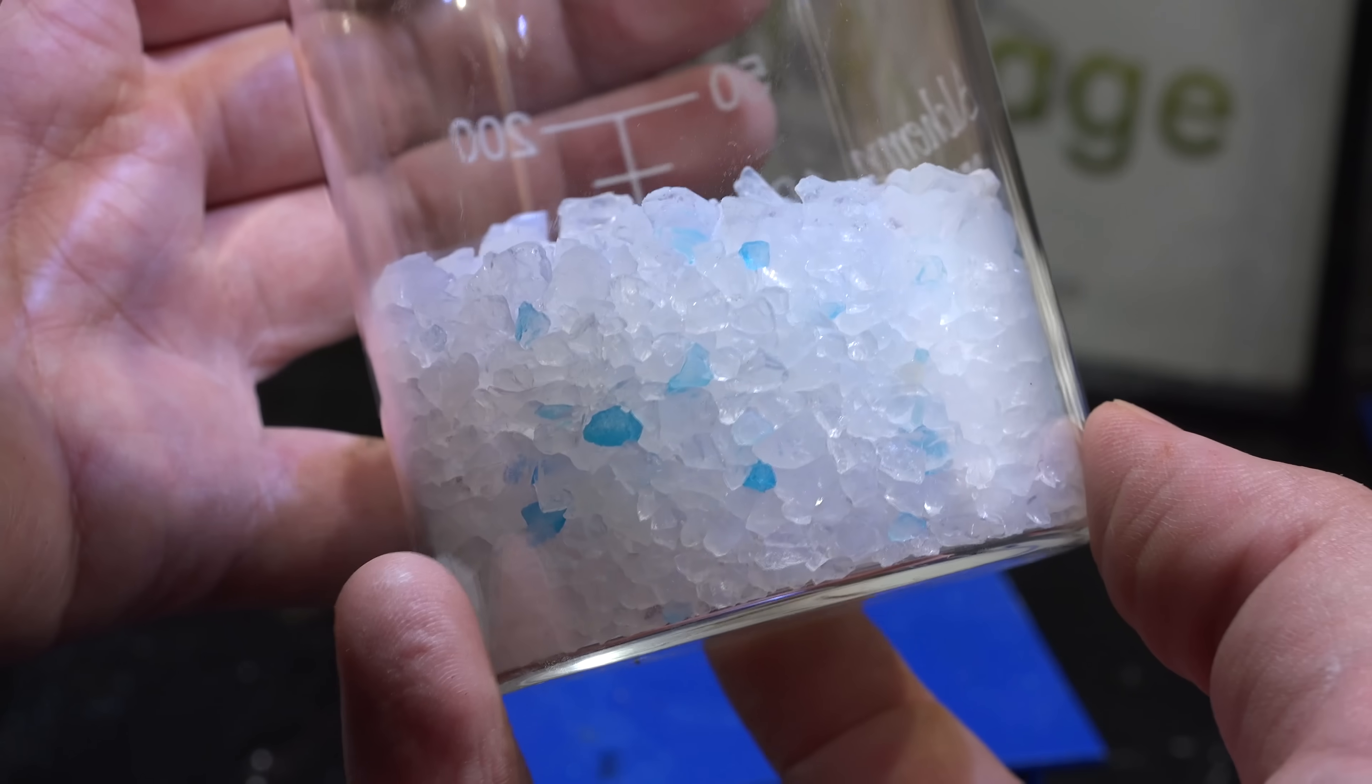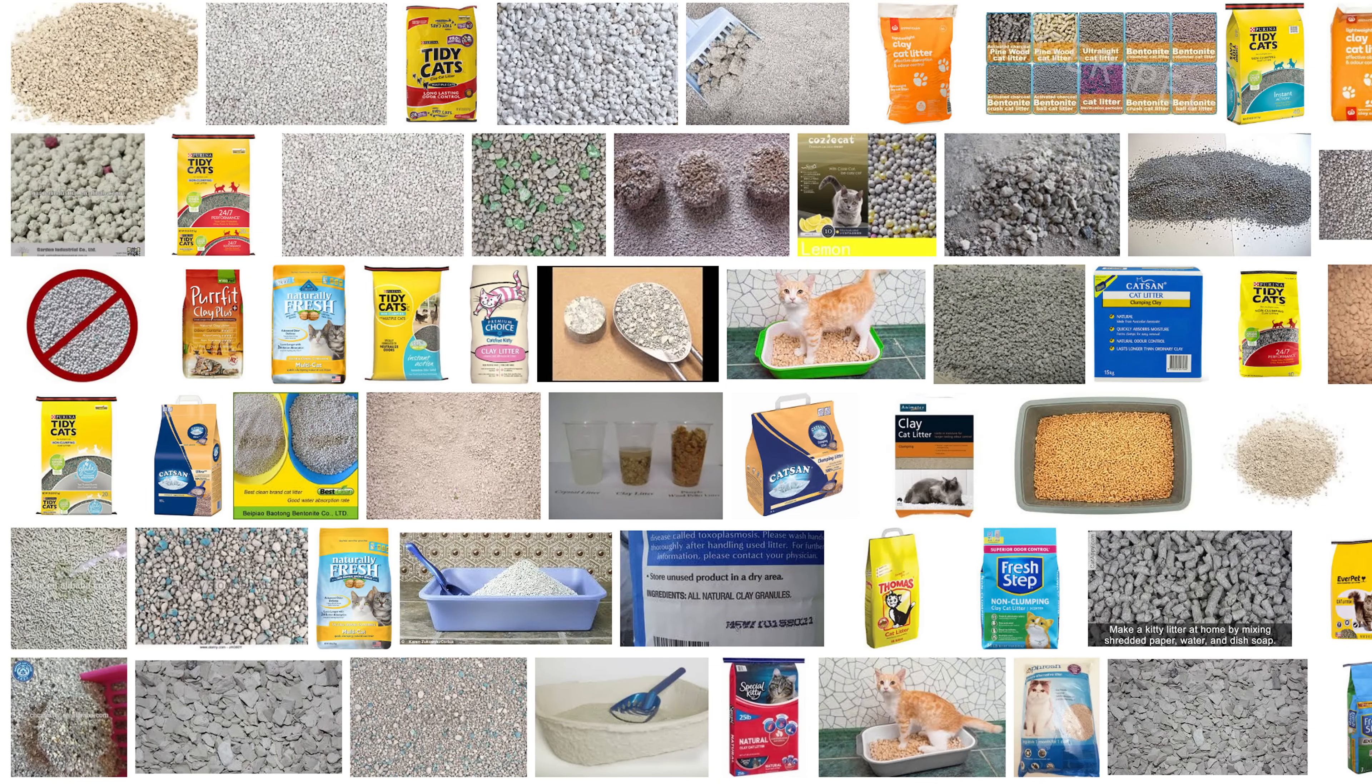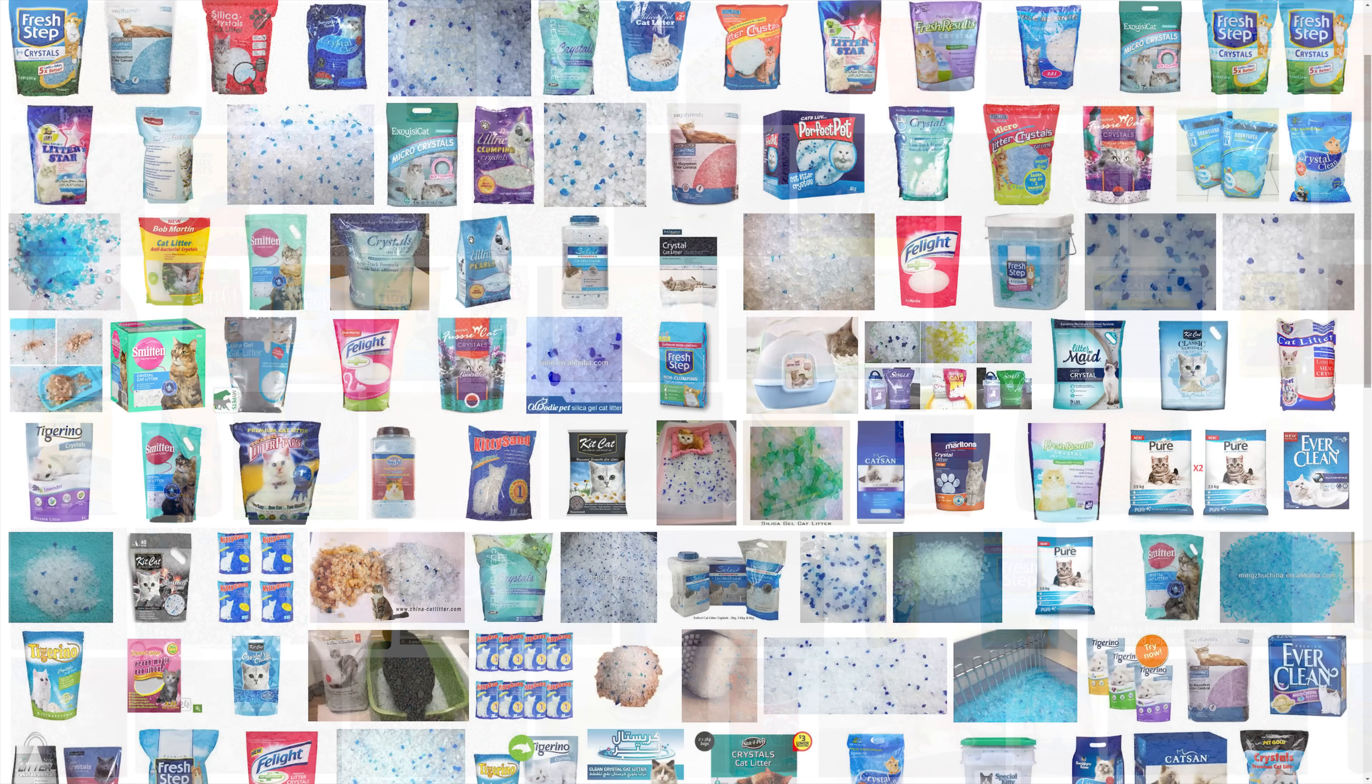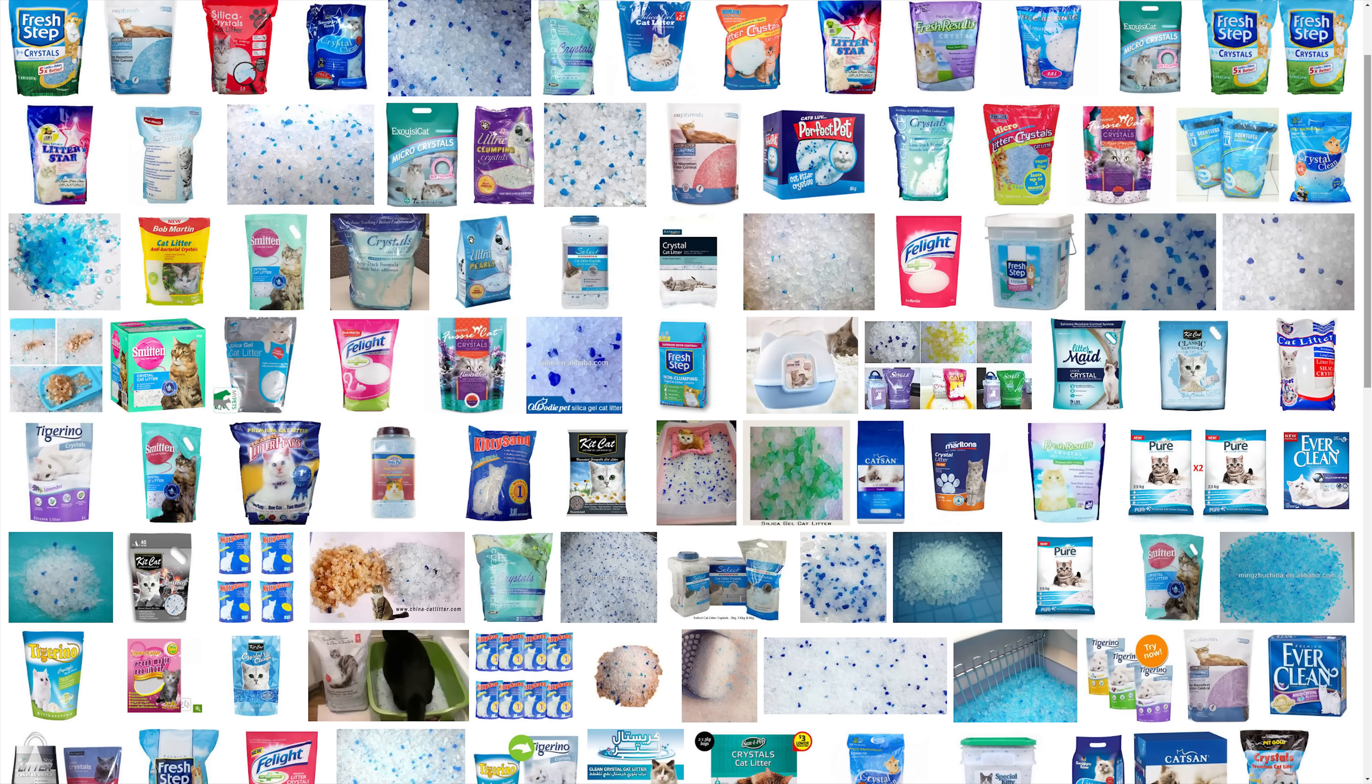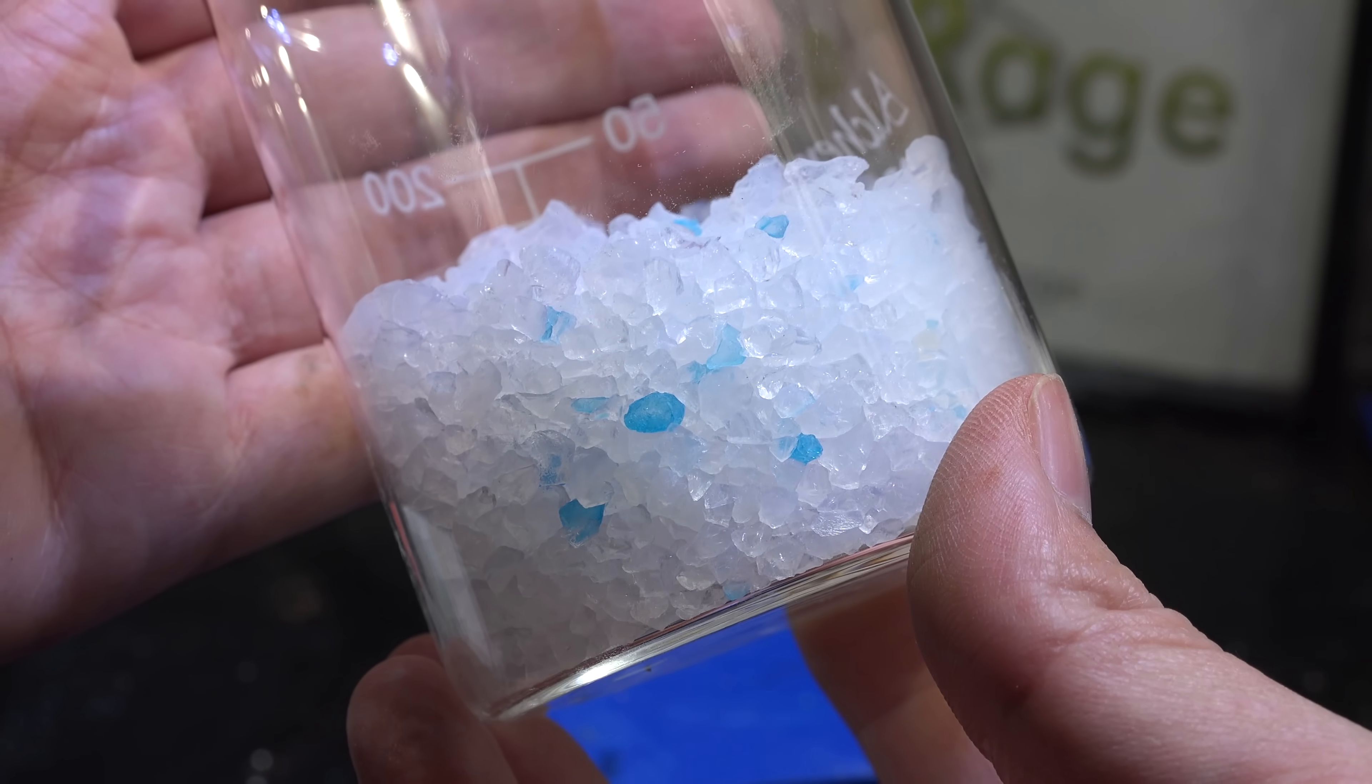Silica gel based cat litter. Most cat litter is based on clay, but you can find some types of cat litter based on silica gel. It's usually called crystal cat litter. While expensive for cat litter, this is much cheaper than silica gel based desiccant bags.